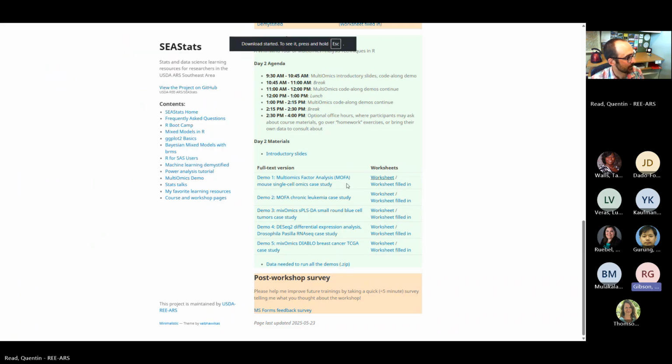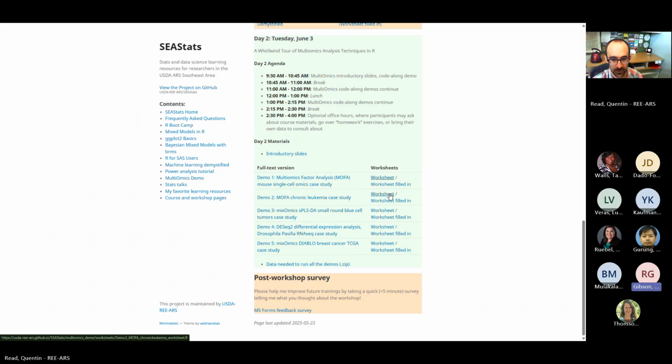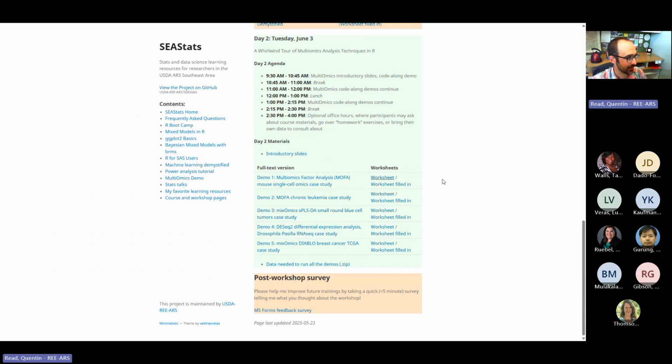I have a quick question. Yes, please. Where do I find the MultiOmics package? Because mine isn't already installed, and I did the big installation with all the packages, and I didn't see it in there. Okay, it should be. I'll pull up that script in just a second and walk through installing that. Just a second. Okay, thank you.